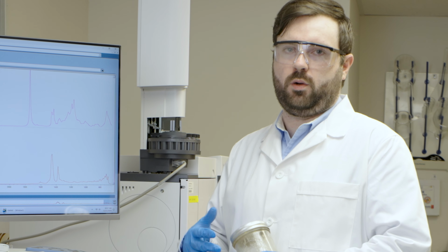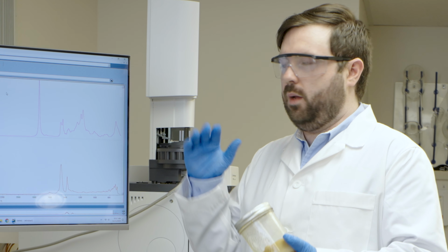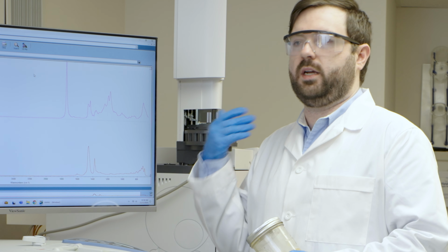All materials in the world have a kind of fingerprint to them, a different kind of way their component looks. So we can measure what this unknown sample is, compare it to the library that we have, and use almost a forensic technology to find out what's going on inside this sample, what is it really, and help identify these unknowns. It's a very powerful machine that lets us find the very minute samples of what's going on inside our fuels.